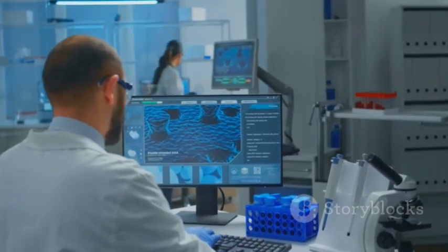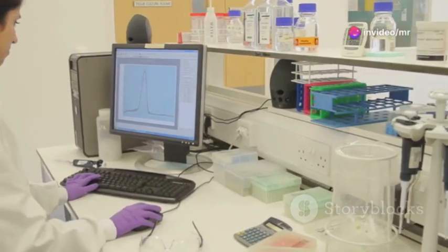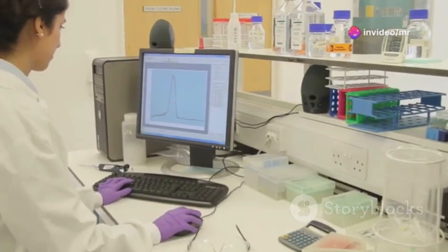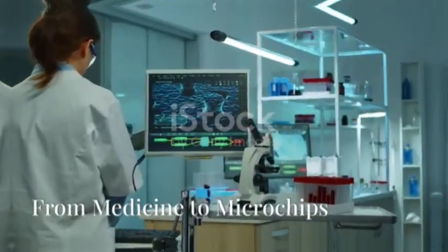By analyzing the position, shape, and intensity of the peaks in the pattern, we can identify the material and determine its phase structure. To decode these patterns, scientists use special software and databases. These tools help us match the experimental data with known diffraction patterns and figure out the identity and structure of our material.